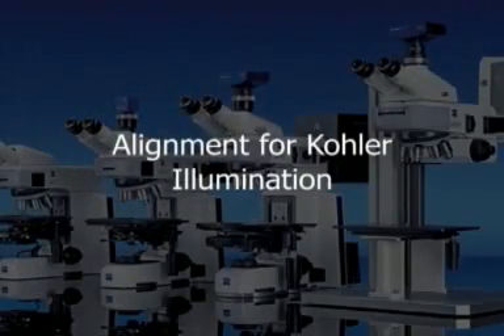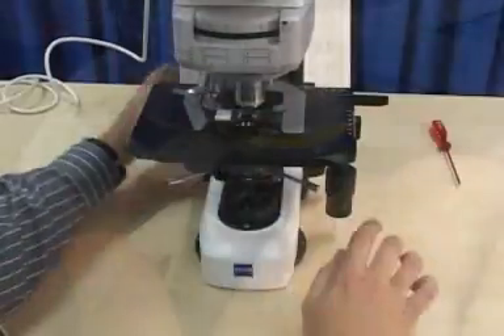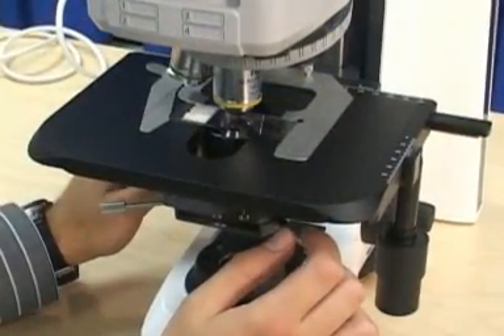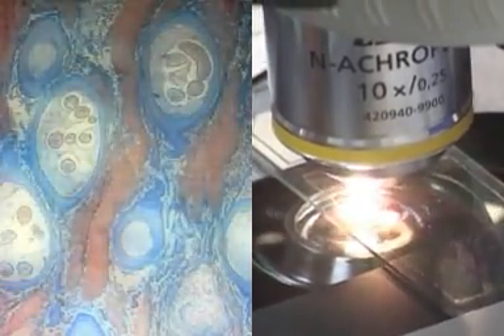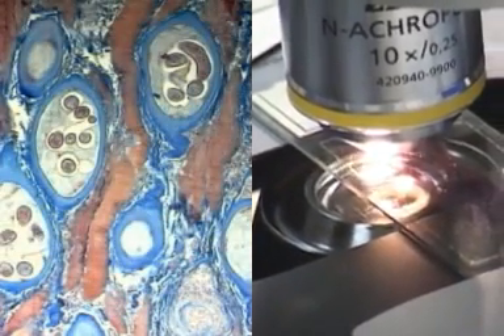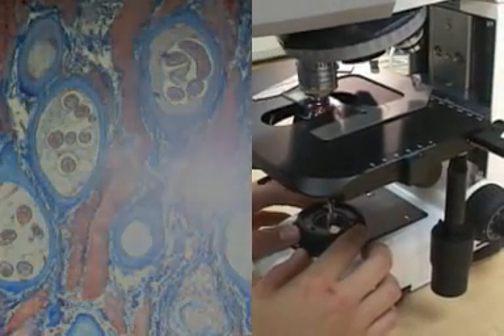Aligning the microscope for Köhler illumination. Switch on the microscope and put a slide on the stage. Rotate the nosepiece so that the 10x objective is in the light path and with the levers on the condenser, flip in the top element. Open the field and aperture diaphragms fully and adjust the intensity of the light so you can focus on the slide. Slowly close the field diaphragm and observe where the brightest spot of the image is.